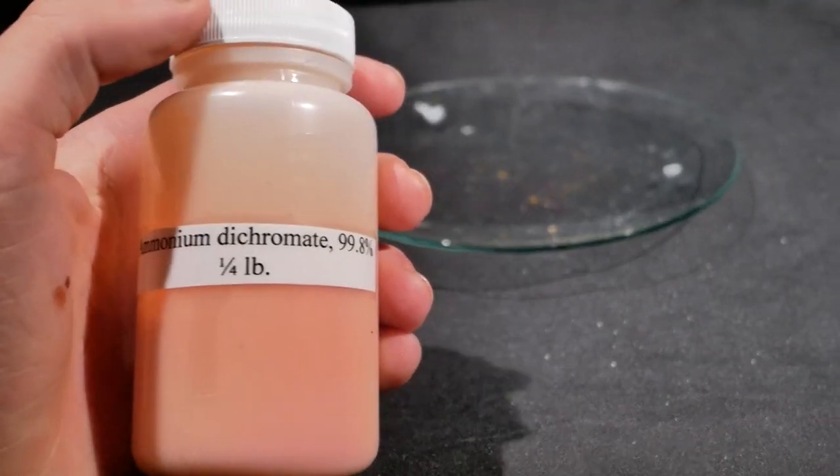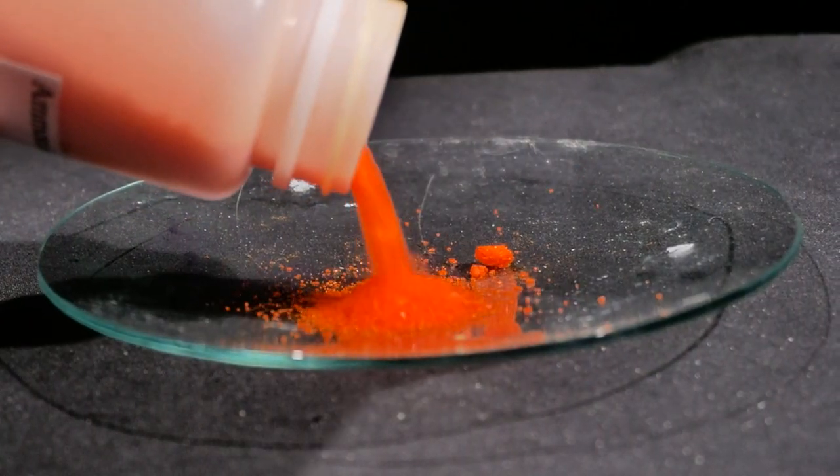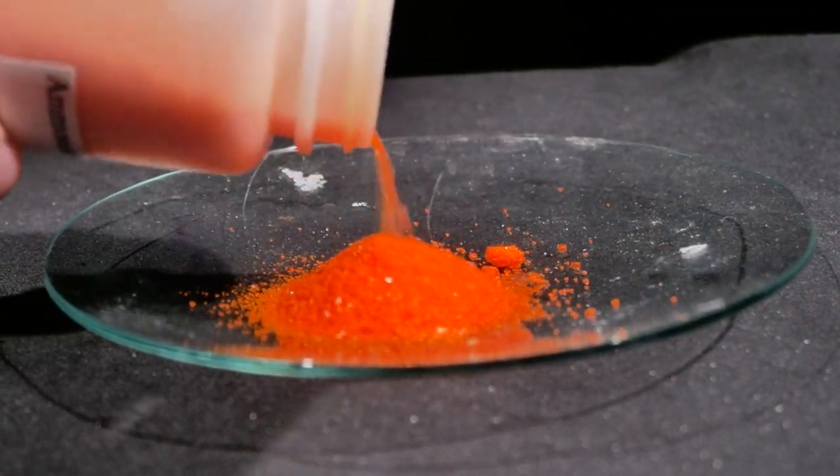This bright orange powder is called ammonium dichromate. It exothermically decomposes into water and nitrogen gas at around 180 degrees Celsius. Unfortunately, this demonstration has become uncommon in schools due to the compound's carcinogenic nature. Let's test it.